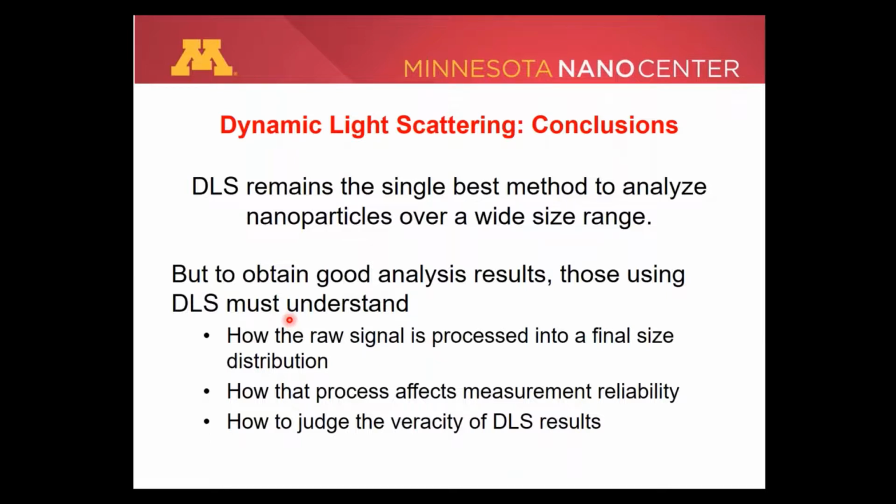Using your skills, you're the judge of the veracity of DLS systems, and you're the ones who are able to make the judgment of how well the measurement is matching reality. And my argument is understanding how it works, how things under the hood affect how it works, can improve that judgment of your measurement accuracy.